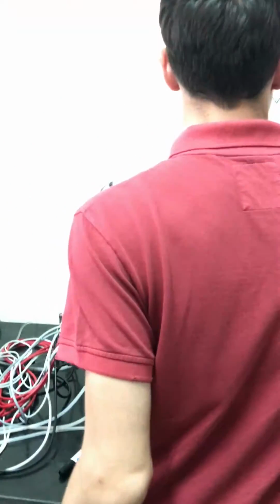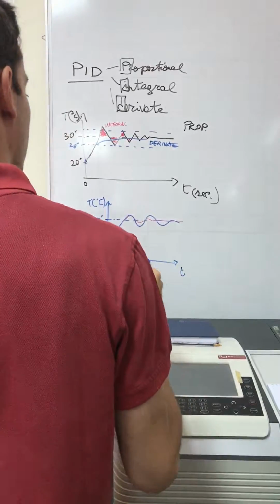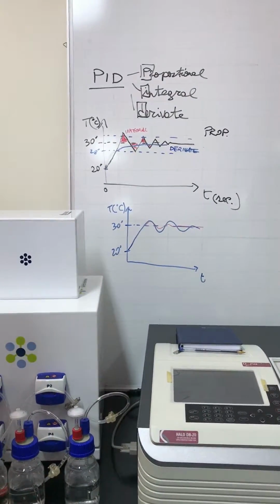Thế thì chúng ta thiết lập độ pH ở đâu thì cái bơm nó hoạt động ở đấy thôi, đúng không ạ? Okay. Also in this case, with the pH, you will see this environment. Thì tương tự với nhiệt độ, độ pH cũng theo dạng biểu đồ giống hình sin này, đúng không ạ?